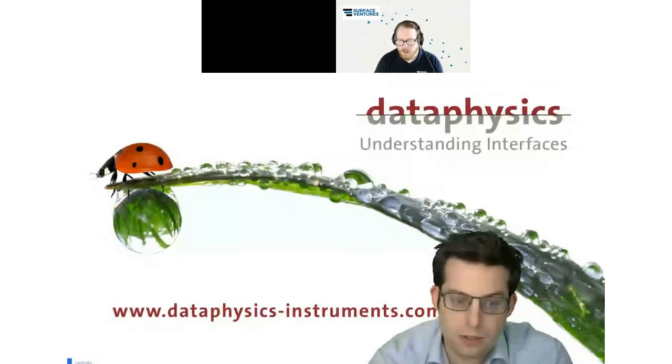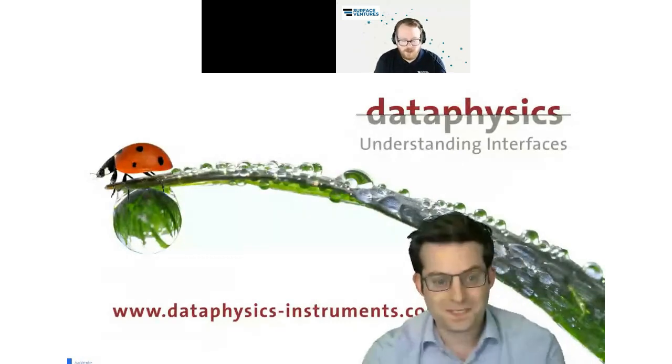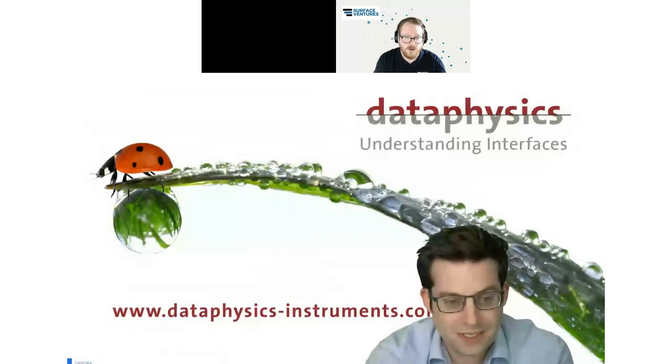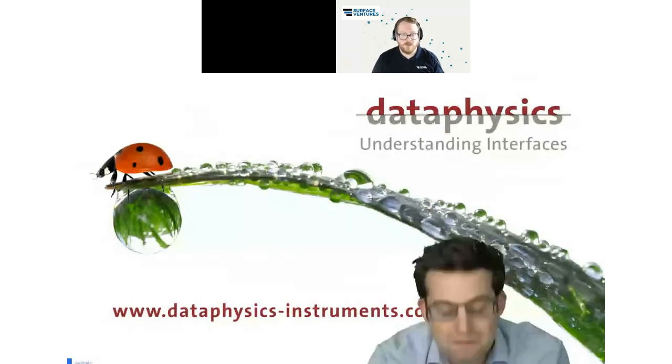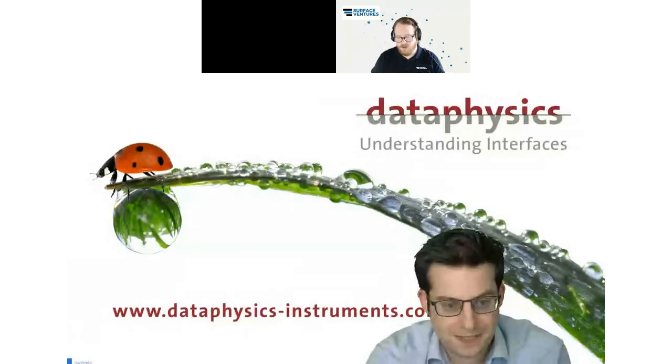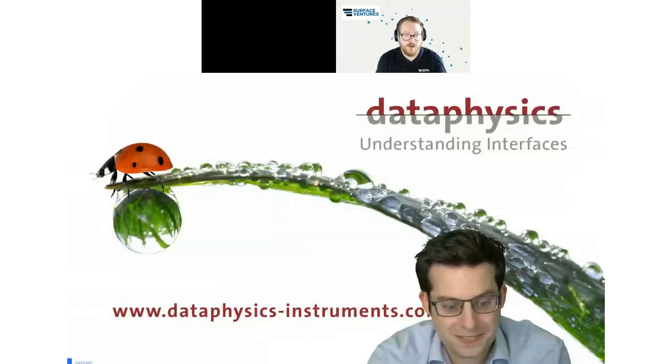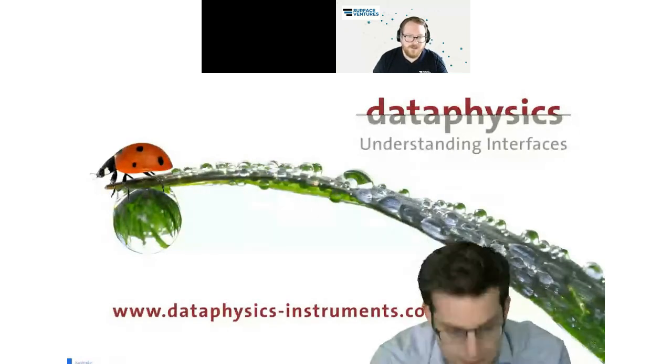Yeah. And just another thing with regard to that: remember, with pretty much all wettability experiments, it has to do with what phases you are measuring against, what solids and what liquids. So when we come back to the term critical surface energy or critical surface tension, you are in some ways limited either by the solid surfaces or the liquids that you're using, requiring this sort of imaginary contact angle.